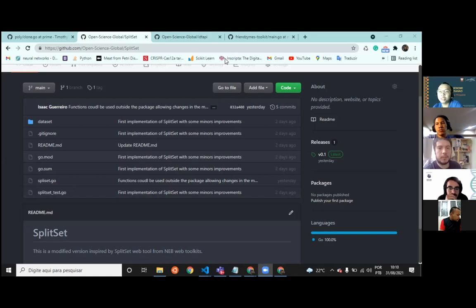What's nice about nanopore is that it's long read sequencing, and I think the longest fragment on record to date is 2 megabases. So it can sequence maybe the entire genome of a small bacterium continuously. Since you are interested in the structural arrangements of your inserts in a particular plasmid, long read sequencing is very appropriate, because if you have a single read that spans 1 megabase, then you have reliable evidence of the exact arrangement of the DNA inserts within your plasmids.